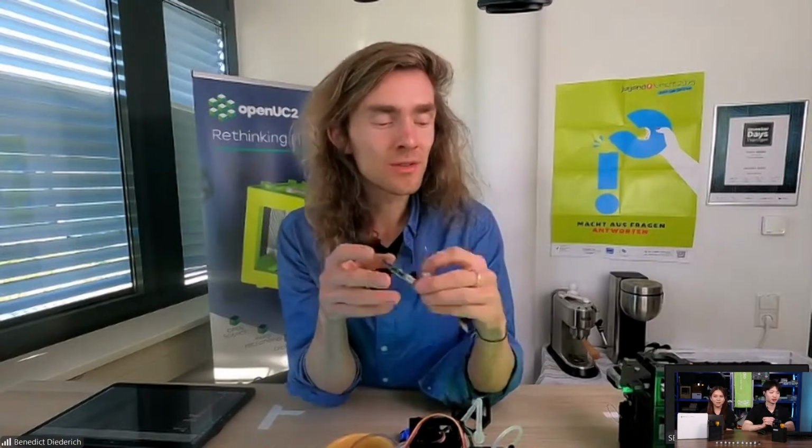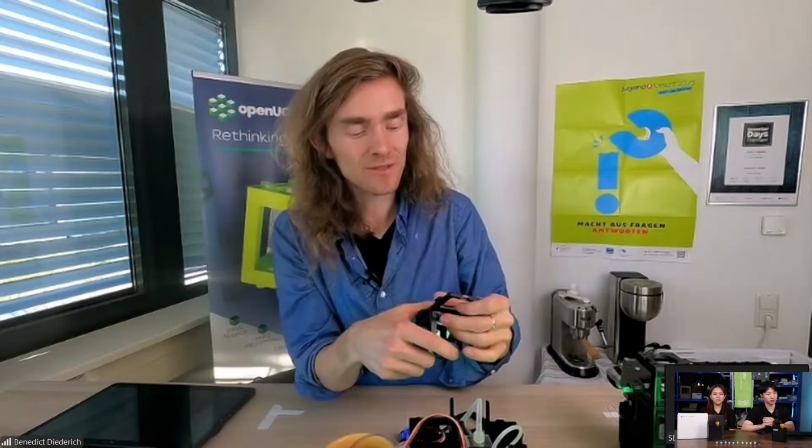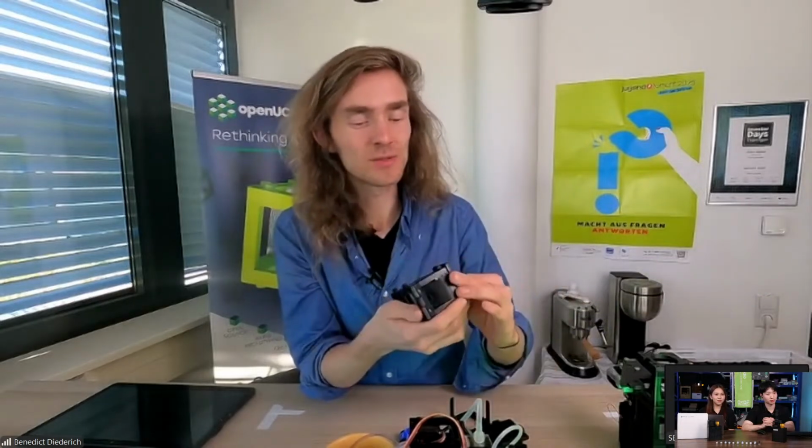But if you have optics, and here in Jena we have lots of optics, it's really difficult to even just mount a single mirror. You have to have tons of posts and mechanical elements to just align two of these things. With this system here, you have these puzzle pieces, and you can easily, for example, have this rather not super helpful setup, but you can have a periscope with just two cubes. And I mean, the idea is that you can have that arbitrarily complicated.